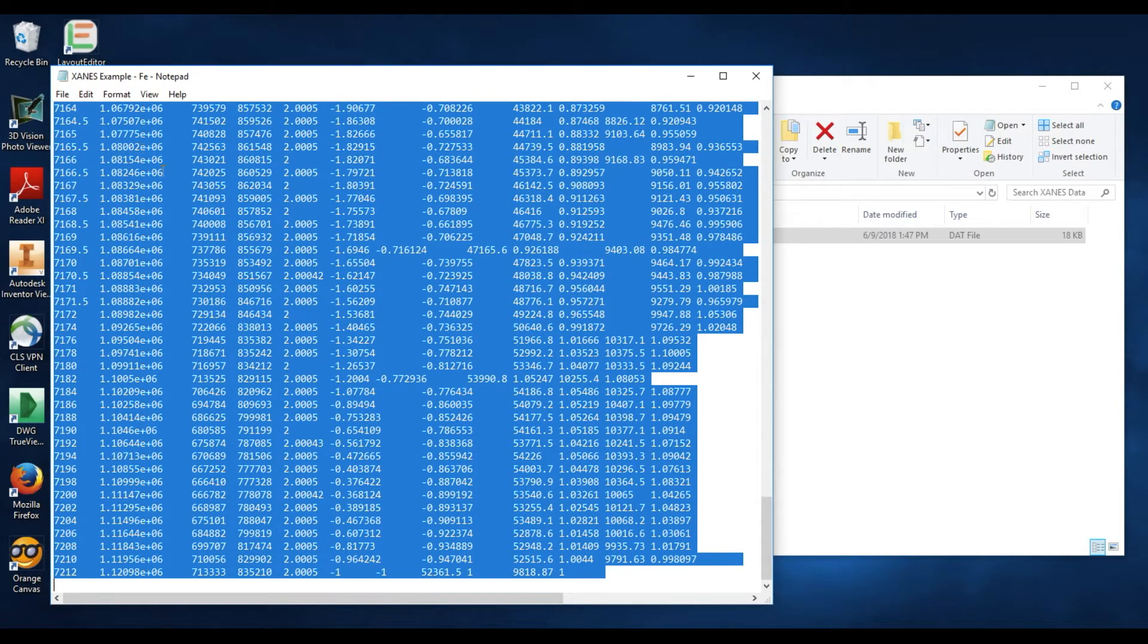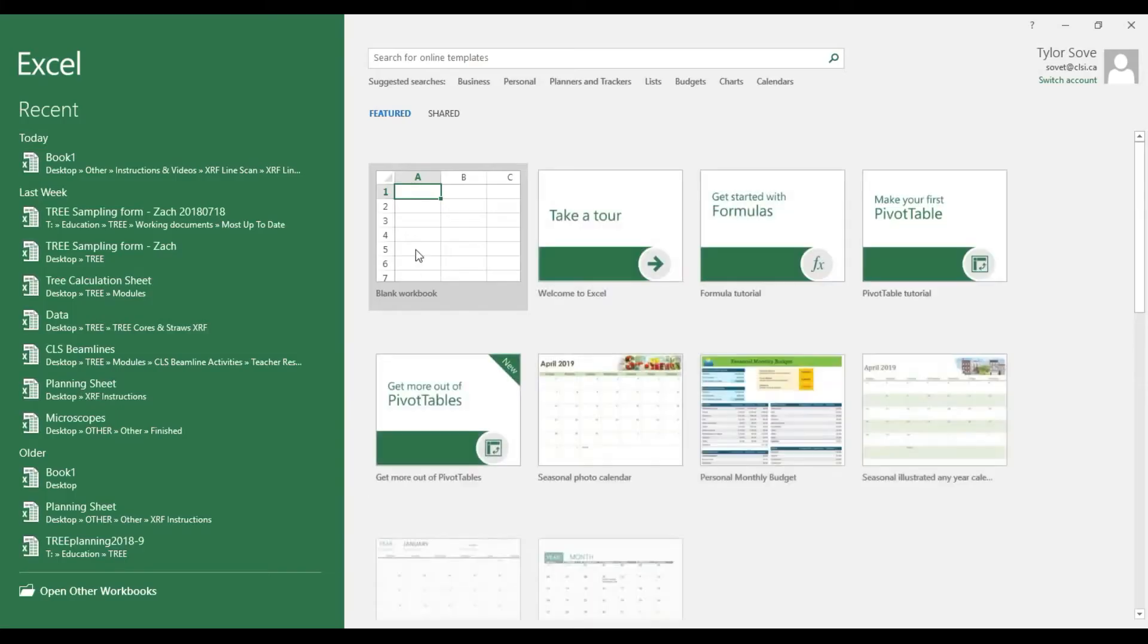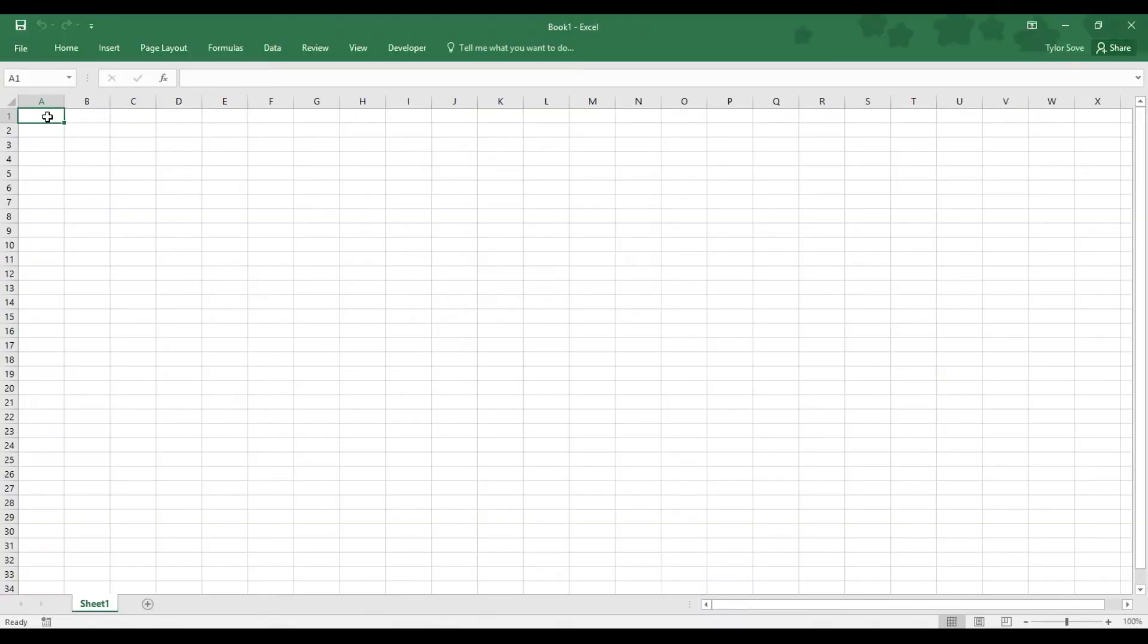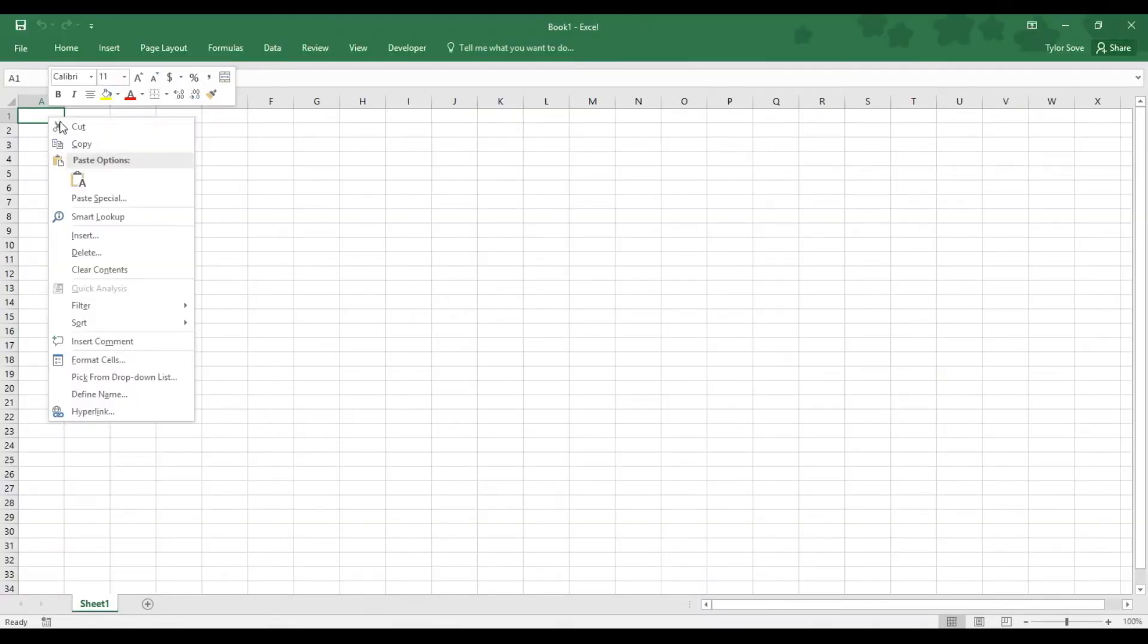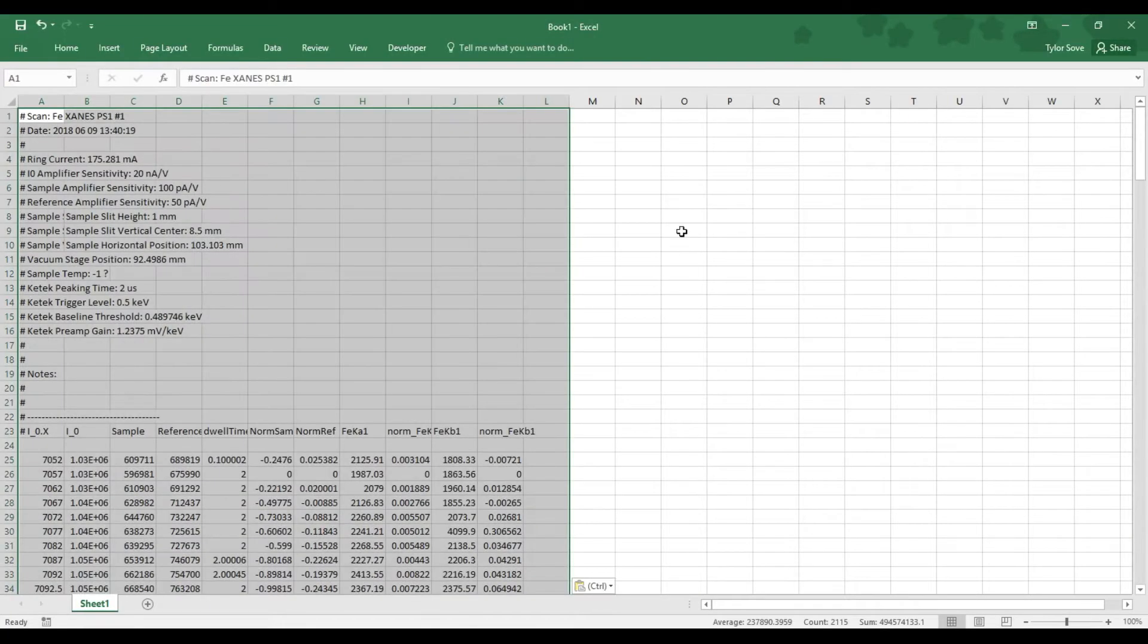Now to paste this into Excel, open up a blank Excel workbook, right-click cell A1, and select the Paste icon.